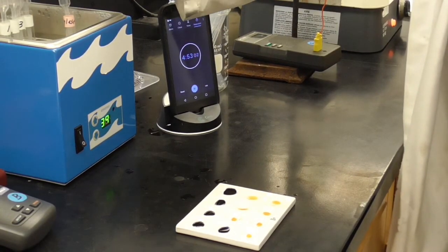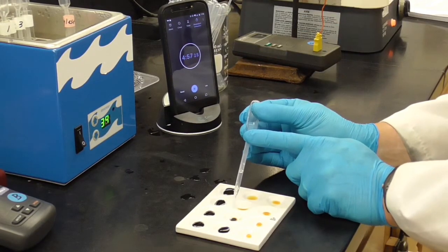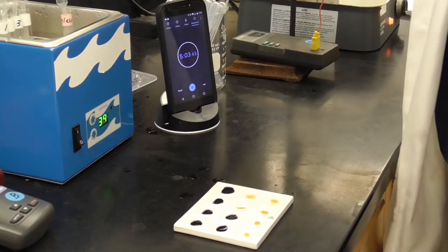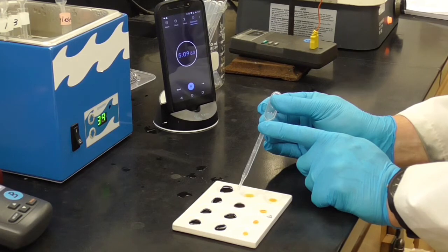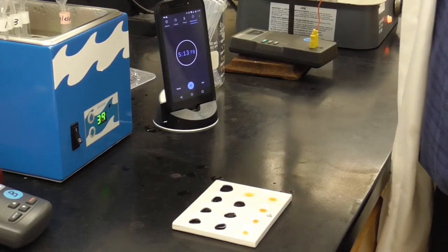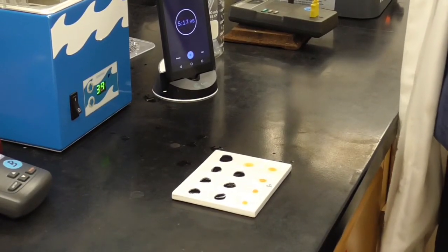Tube 2, where we put only 2 drops of the enzyme. 1, 2, 3, 4. Looks pretty dark. Tube 3, where we put 4 drops of the enzyme. 1, 2, 3, 4. It's not quite as dark, and I don't know if you can see that well on the camera, but it is a little bit different.